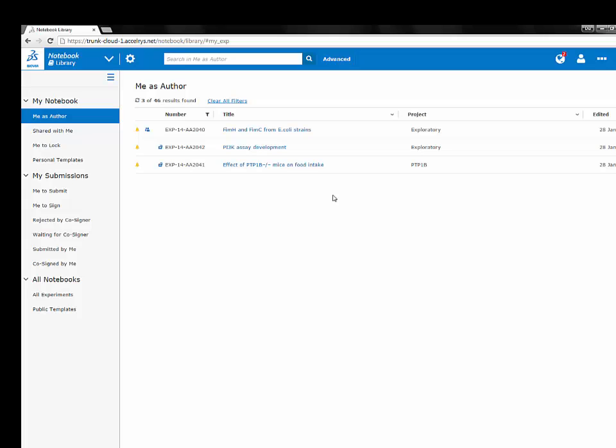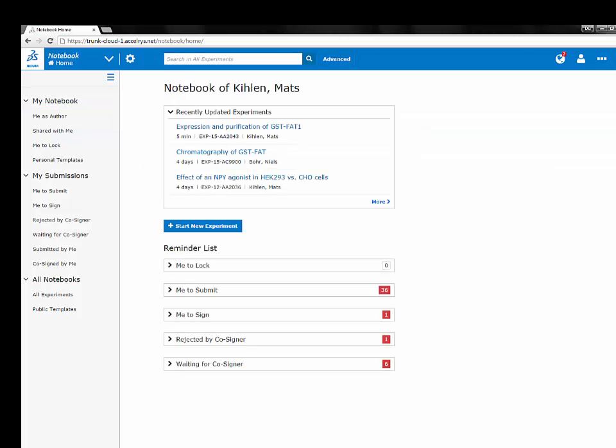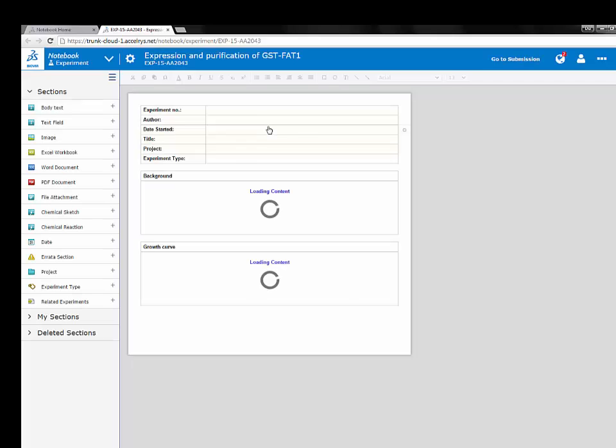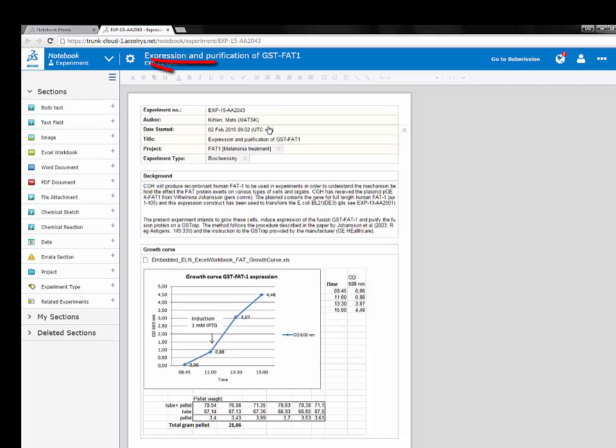Whether there are collaborators, if there is a reminder, and the latest submission status of that experiment. Clicking on an experiment title opens the experiment in another tab. Clicking on the experiment row highlights the experiment, allowing you to then click on the cogwheel at the top to see all the possible actions without having to open the editor.